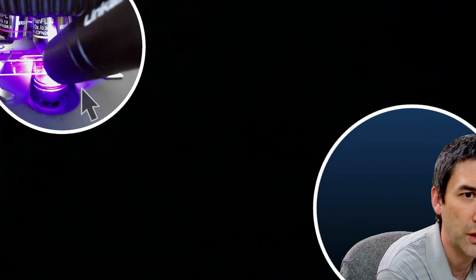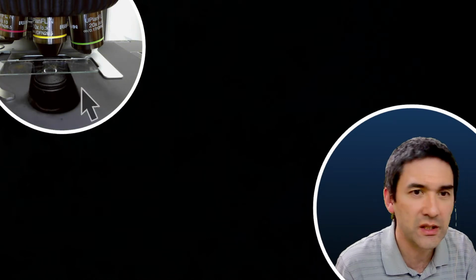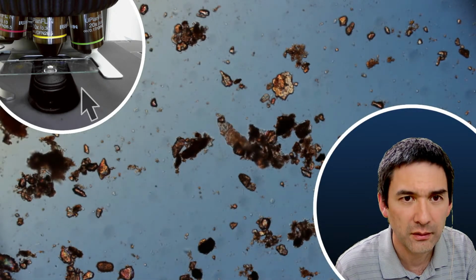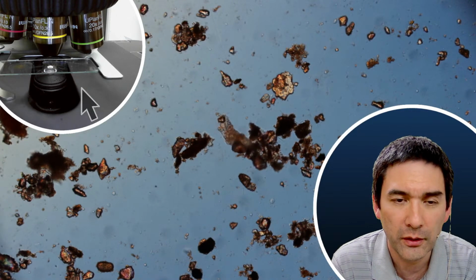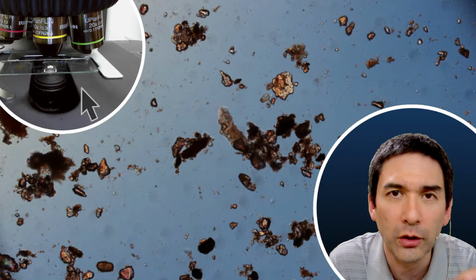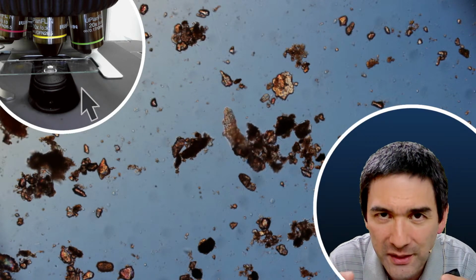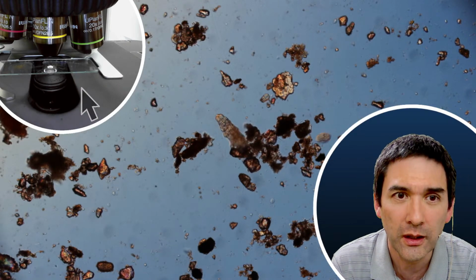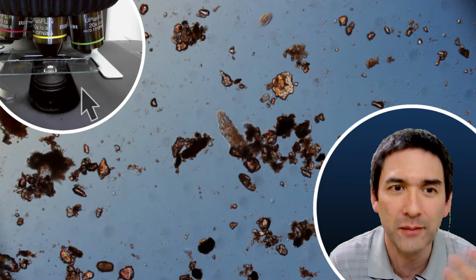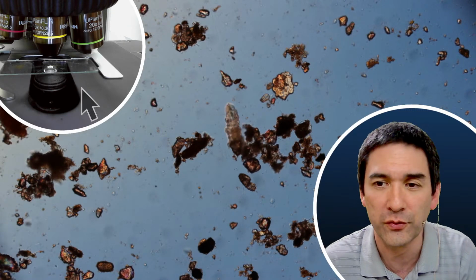Lower magnification. No, I guess you have to actually shine it in from the bottom. So what you have to do is with a UV light, you shine it in from the bottom, and then you use a dark field patch stop. So this basically means that the UV light will strike the specimen from the side. And then the fluorescent light is going to be emitted. This actually does work, but sometimes you need a very long exposure, because sometimes the autofluorescence is very weak.